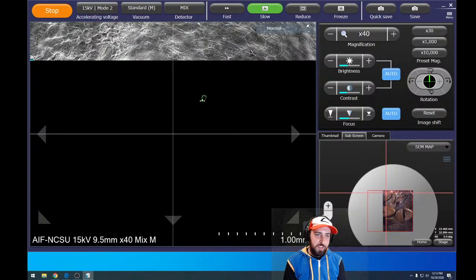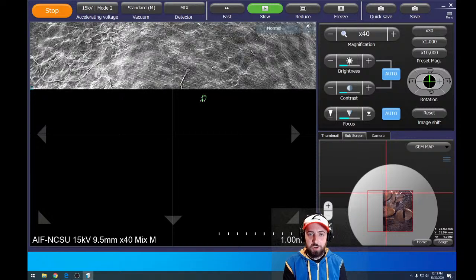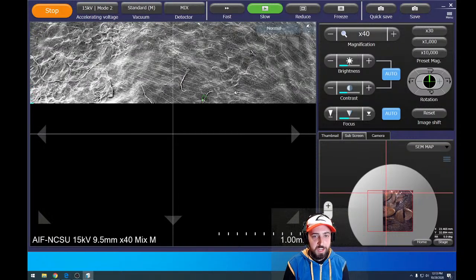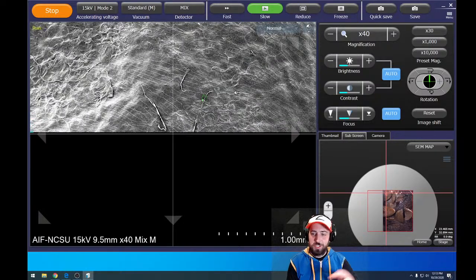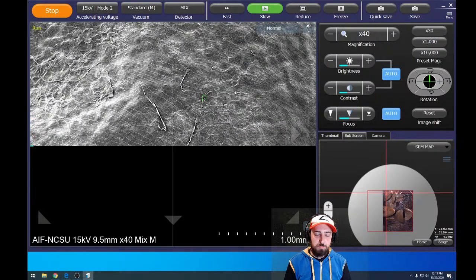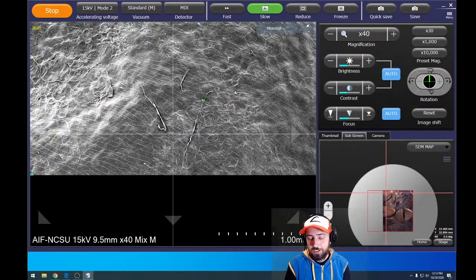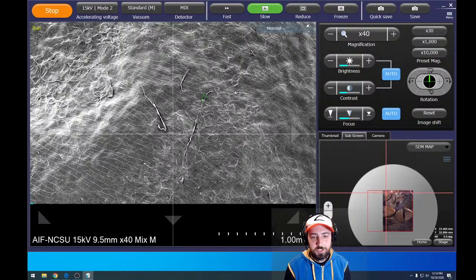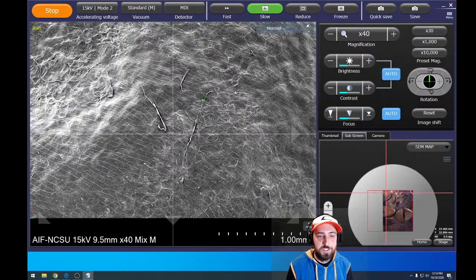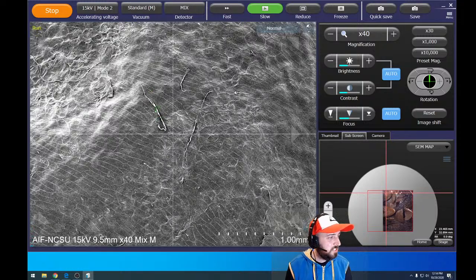And so, when I showed the pumpkin earlier, we had a lot of fibers in it. I did put fibers on the stub, but it's the stub that I put in just a little bit too big, so it's off the screen. But the fibers in the pumpkin, the best I can tell, are really there to hold the seeds and kind of secure them. And I think the seeds kind of grow off of the fibers. I may not be totally wrong. So, anyways, the point is there are fibers on the seed, and that's what those little pumpkin guts, the orange fibers, that's what this is.